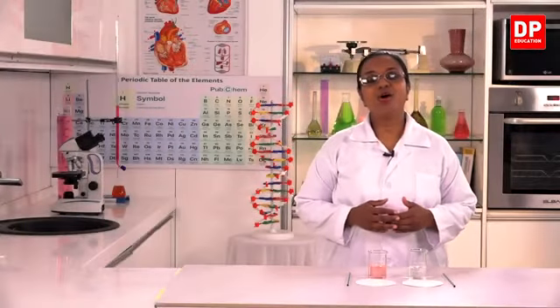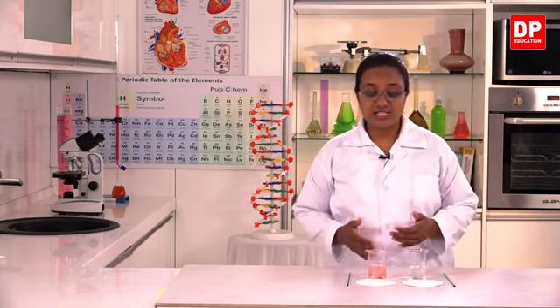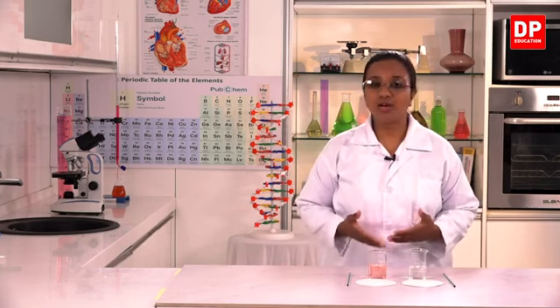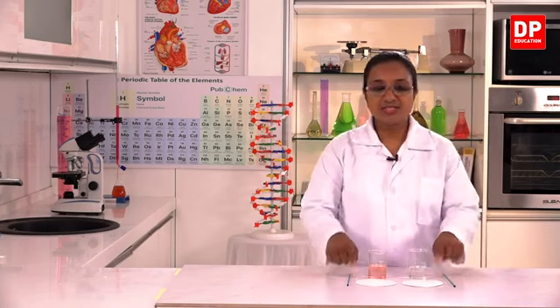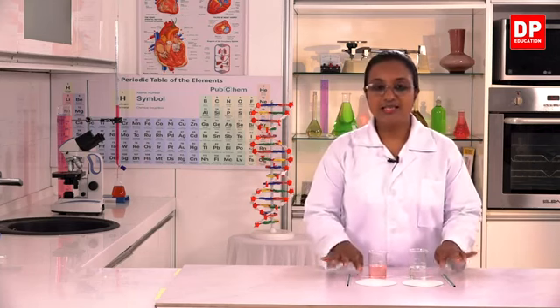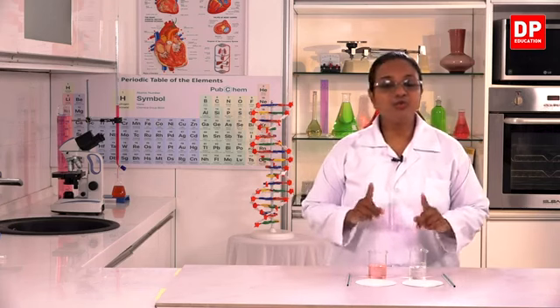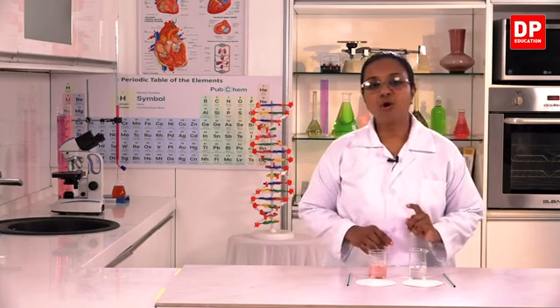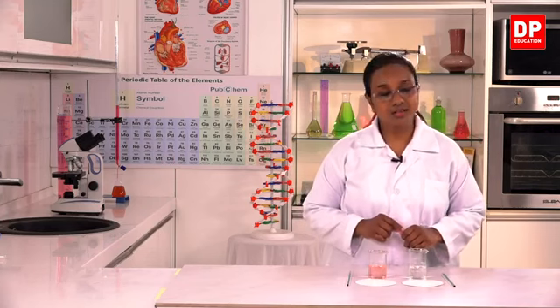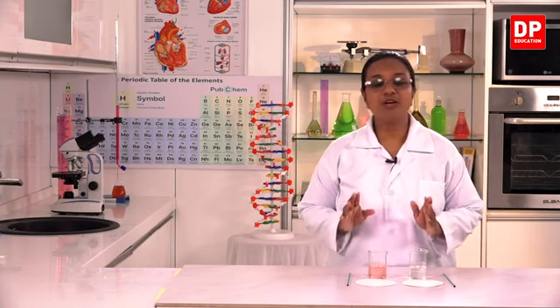Okay students, now we are going to do this activity to observe the effect of nature of solvent on solubility. So here the room temperature is the same and I have the same solute, sugar, and I have weighed 5 grams of sugar and taken it in filter papers. And here I have two different solvents of the same volume, 50 centimeter cube of water and 50 centimeter cube of kerosene. So the volumes are the same, only difference is the nature of solvent.